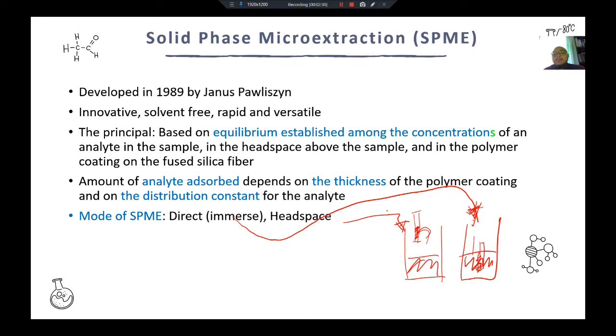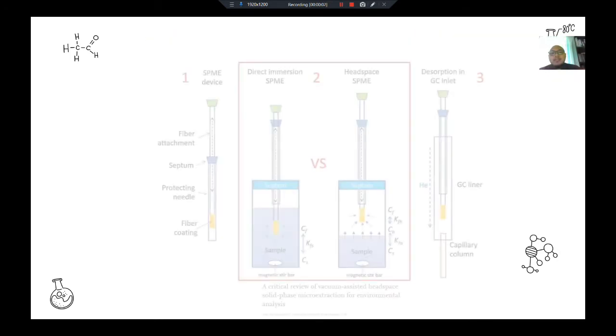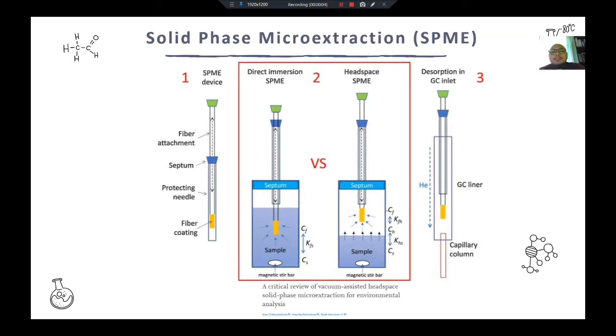coating. Okay, so the fiber is very fragile, and then yeah, that's thing lah, it's quite expensive. Okay, but later we will look into the cost effective. Okay, which one is much more effective lah. Okay, here is the method. Okay, how it's look like. Okay, right, if you look over here, we have the syringe.